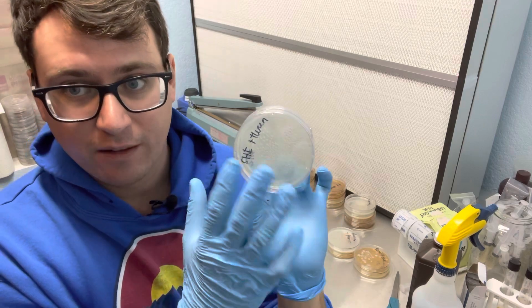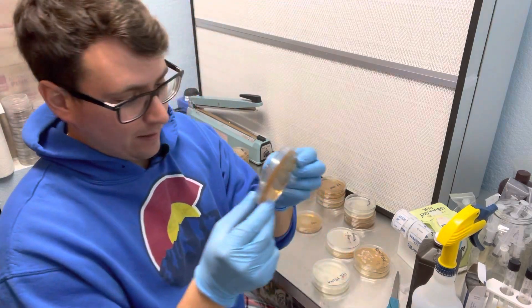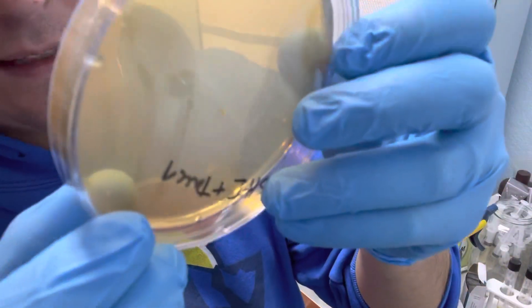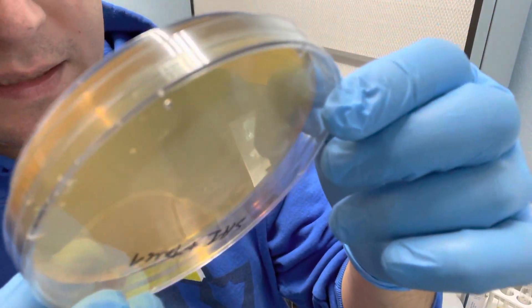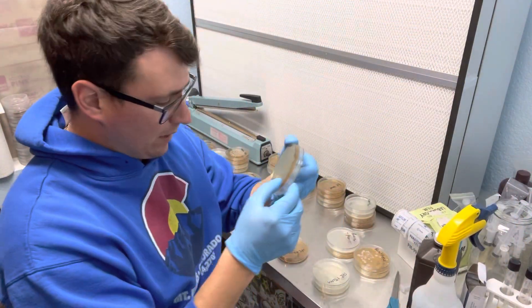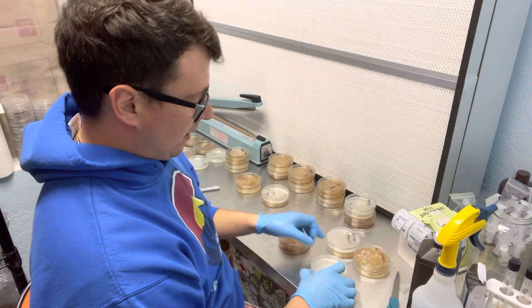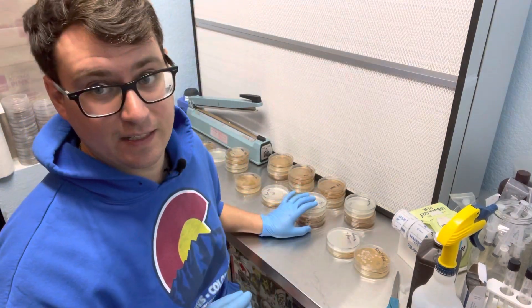I'll show the progression of this as the spores start to germinate. But then on the MEA plate, there's a couple colonies. I wish I could take the lid off and kind of show it a little closer, but I still see some spores that haven't really taken off yet on the MEA. And it looks like there's a colony here, possibly some bacteria, but that's okay. So shiitake on PDA with tween, we see some very early stage colonies forming.